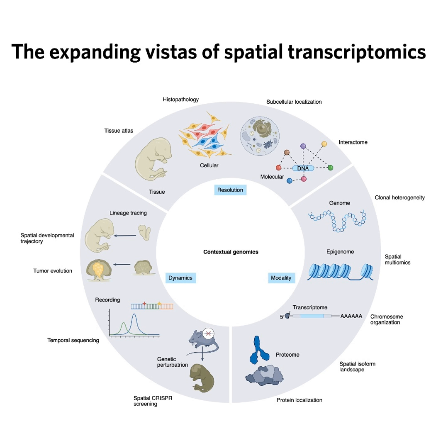Okay, let's start with expanding modalities, going beyond just standard messenger RNA. Absolutely. The same core principles, spatial barcoding, high-resolution imaging, can theoretically be applied to almost anything within the cell or tissue. We'll definitely see, and are starting to see, spatial profiling of genomic variation, things like mapping specific mutations in cancer tissues spatially. And epigenetics. Yes, epigenomic regulation, mapping where the chromatin is open and accessible for transcription, for instance.